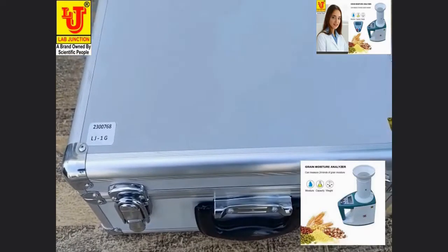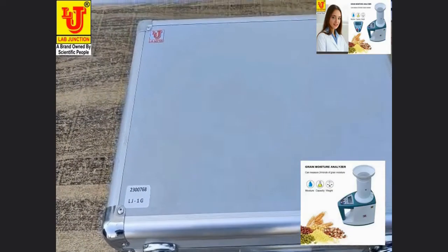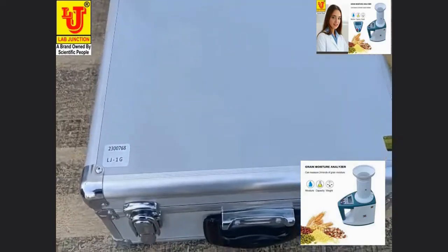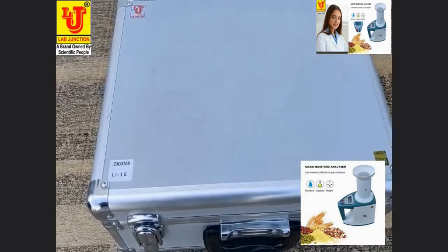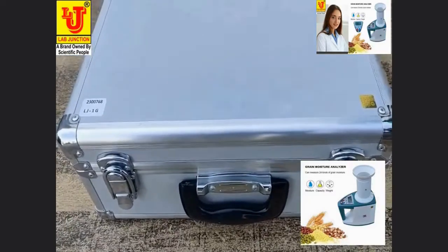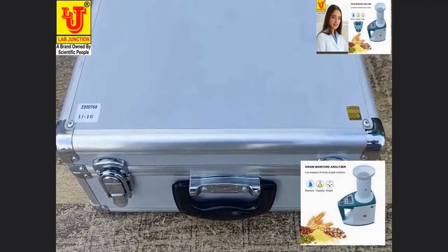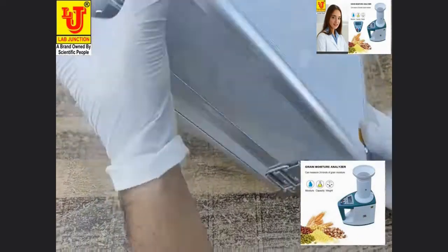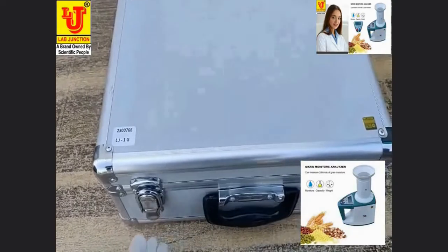This is the Lab Junction Green Moisture Meter, model LJ1G. This is our main instrument, equipped in a small suitcase. Now unlocking this.